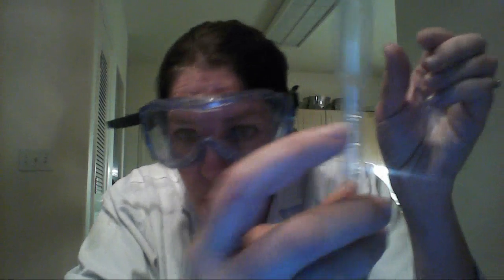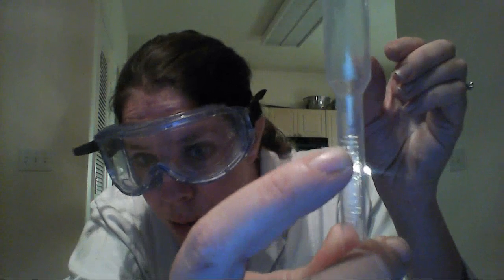And you want 2 full milliliters of this. Notice that on at least the pipette that came with my kit, the top line is 3 milliliters. You probably can't see that. You want 2, which on mine, the 2 is right there. So just be sure to check your pipette because you might have a skinnier pipette than I do. But for me, 2 milliliters is right in the middle.